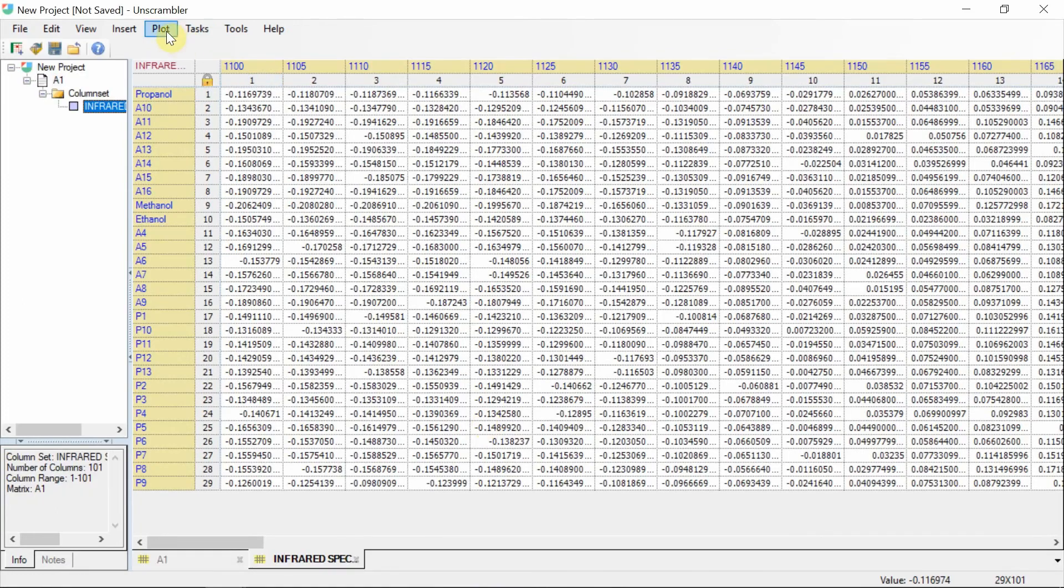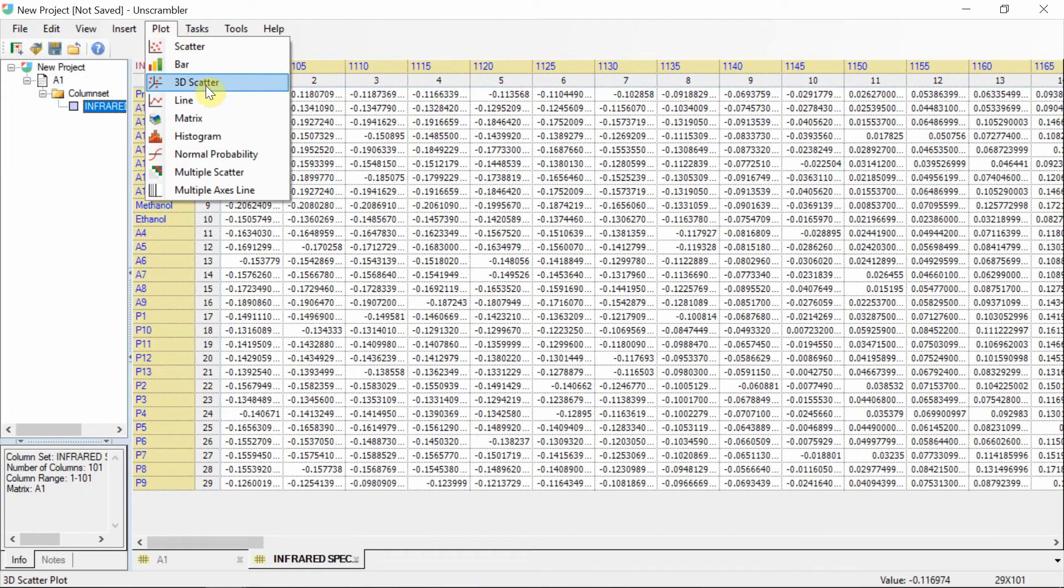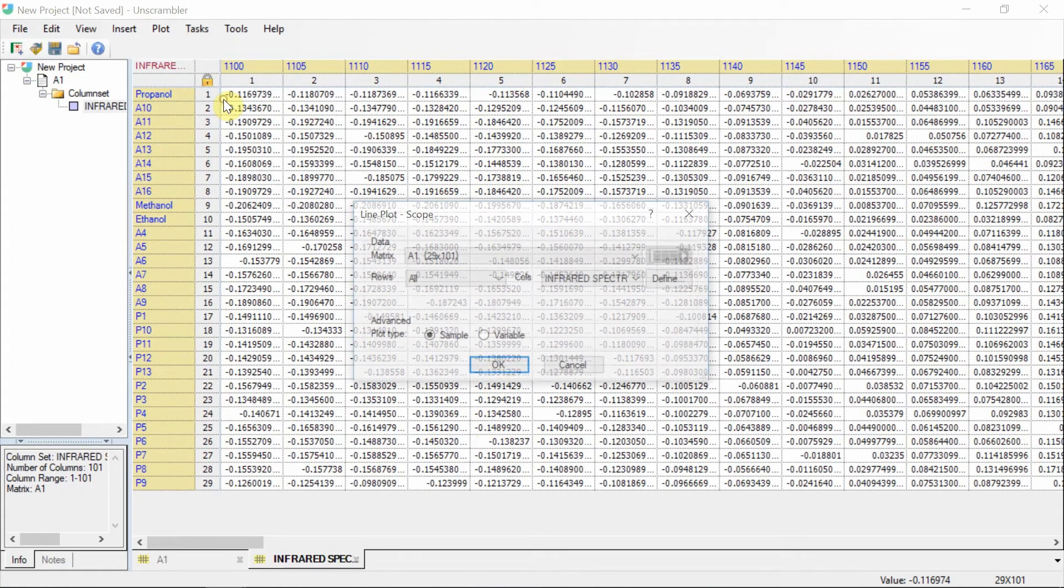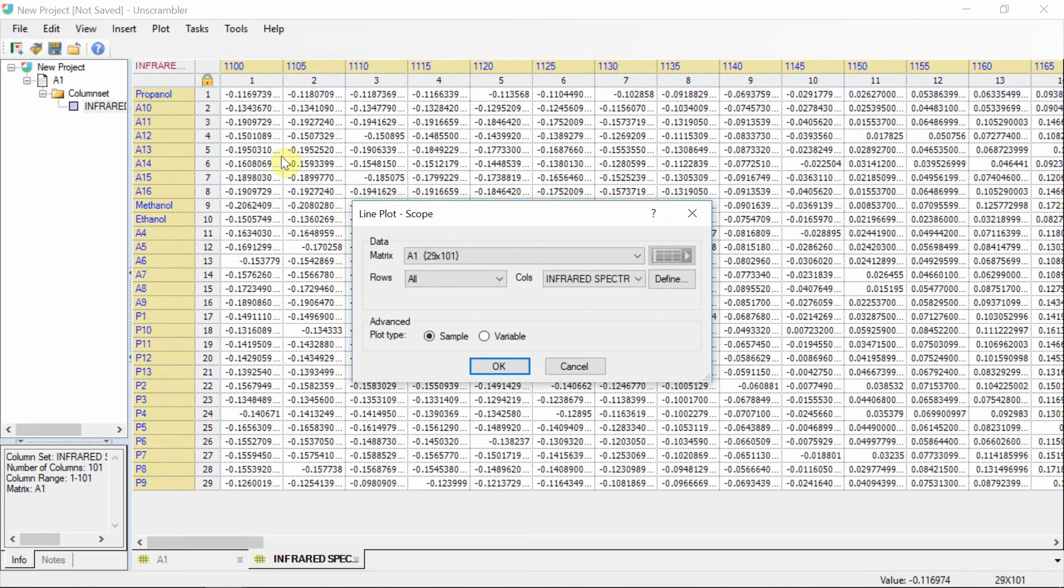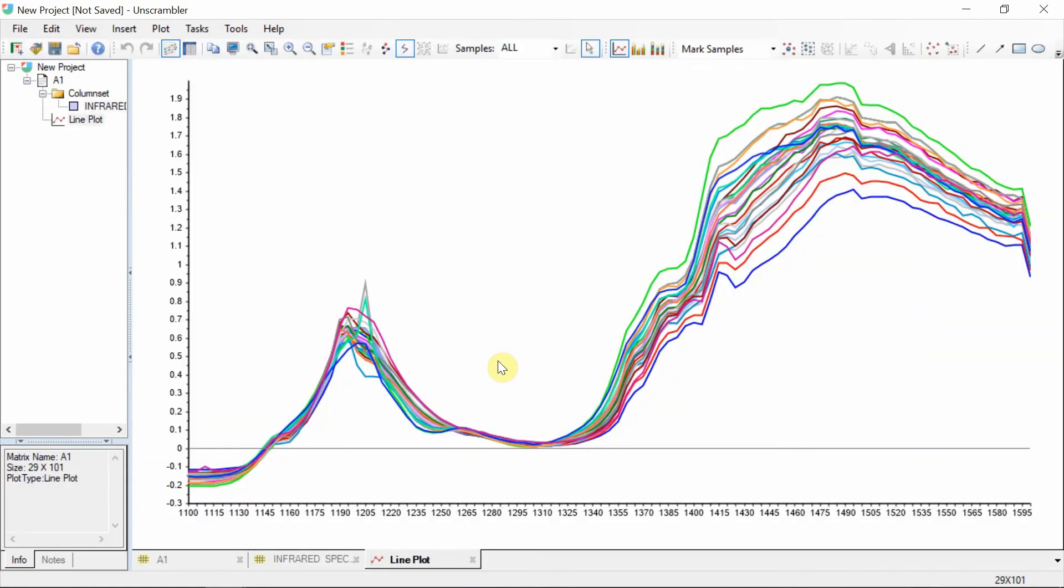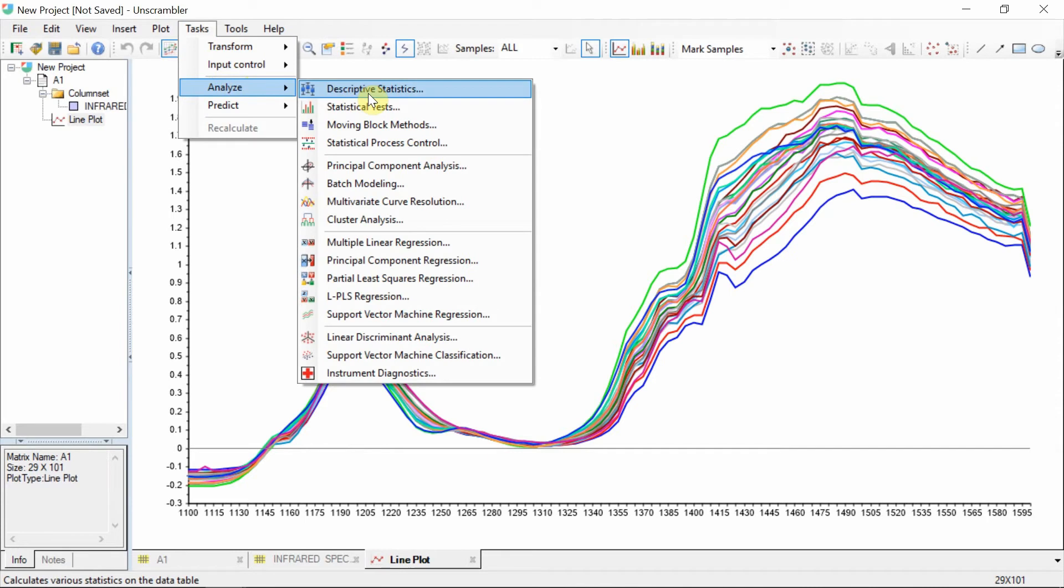For spectral data, a line plot is a very appropriate way to visualize the raw data before analysis. We can also perform descriptive statistics.